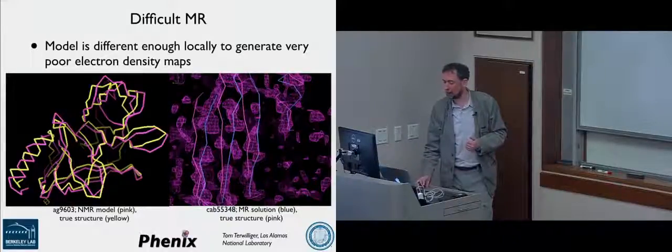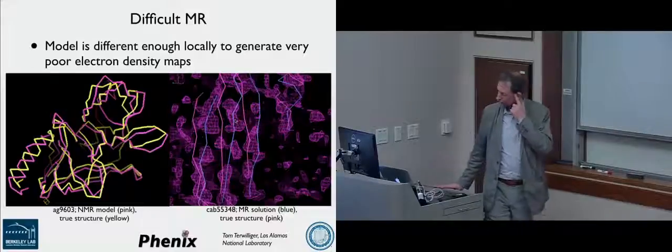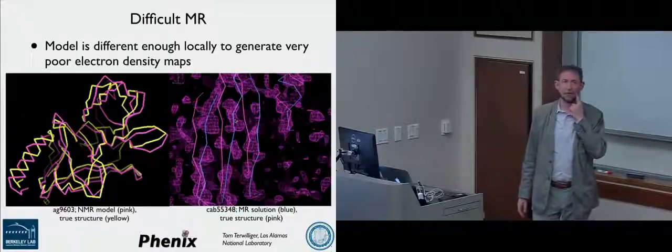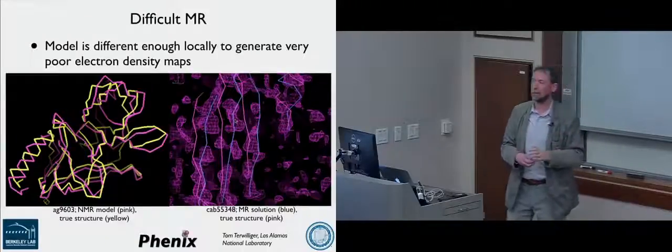You can see that they say a lot more about the input model than the truth. It's model bias. And I think people have probably encountered this several times, and in many cases probably given up and said, well, it wasn't a solution, and stopped.